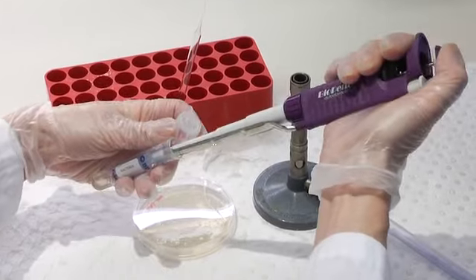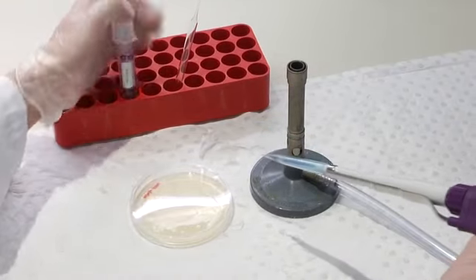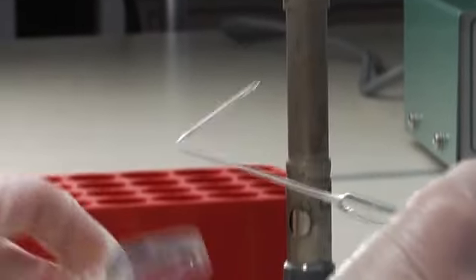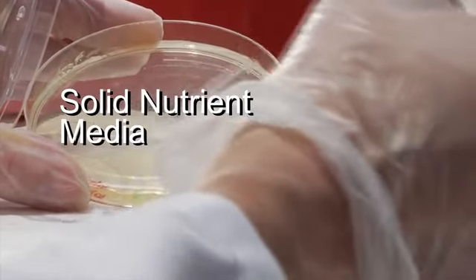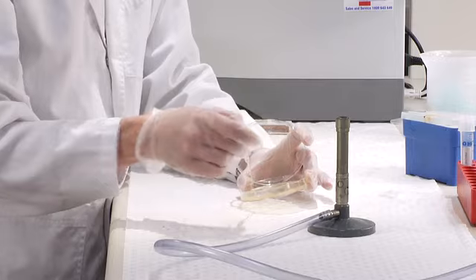Now the plasmid has had a chance to express its antibiotic resistance gene, I can spread the bacteria out onto a solid nutrient media containing antibiotics. Then I'll just take this plate to the incubator and let the bacteria grow overnight.